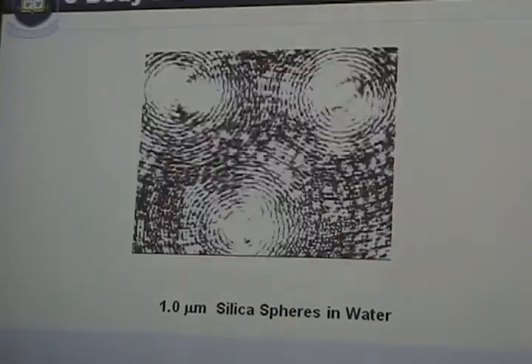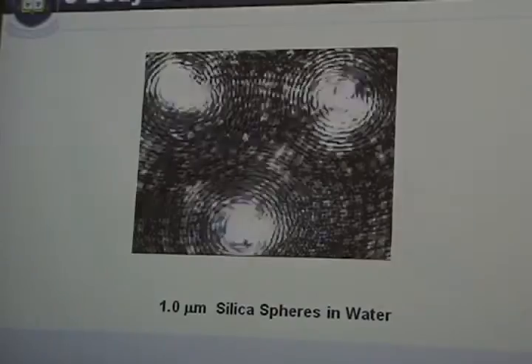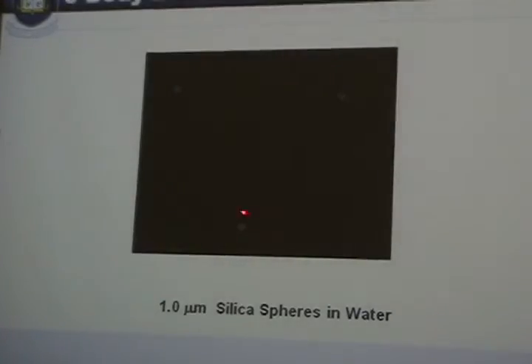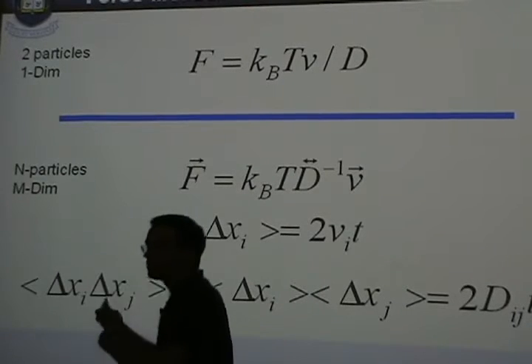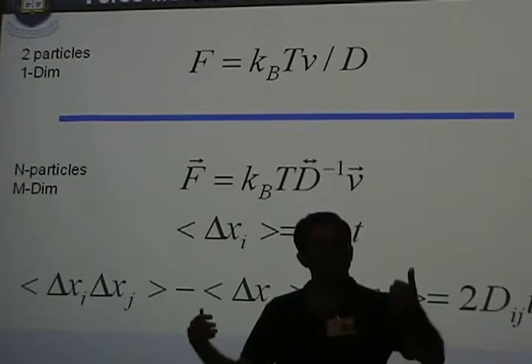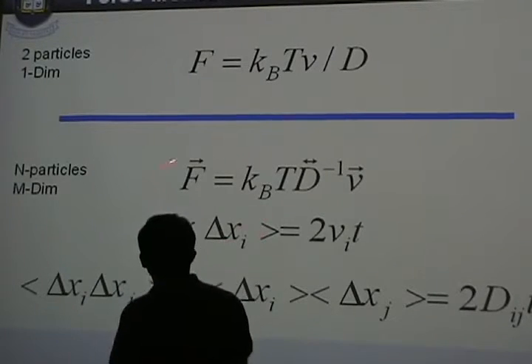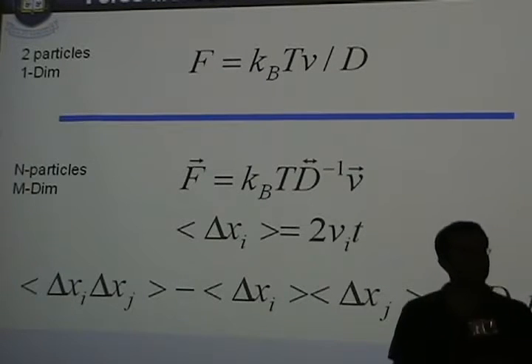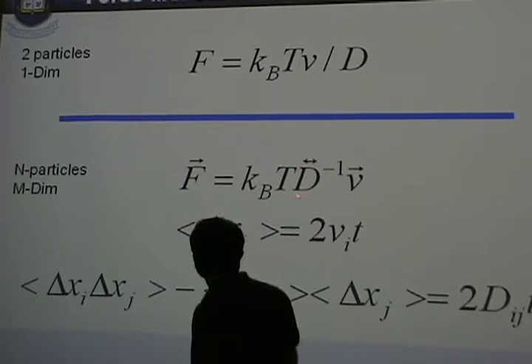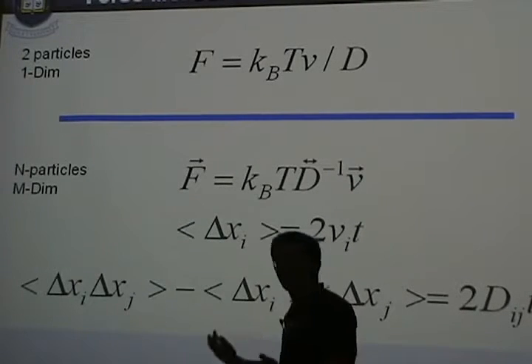And so what we do is we take not just two particles and put them together, but we bring a bunch of particles together. In the simplest case, we bring three. It makes our data analysis a little bit trickier because what was once a one-dimensional relationship between scalar transport coefficients, velocity and diffusion, we now have a multi-dimensional relationship. But it's still a linear relationship between a tensorial diffusion coefficient and a vectorial velocity.